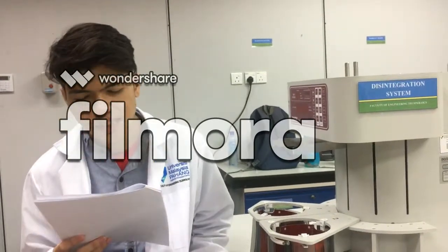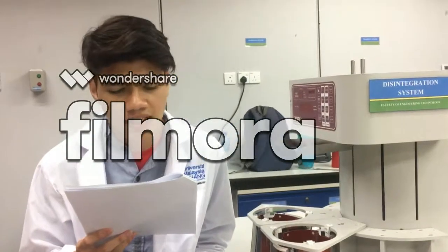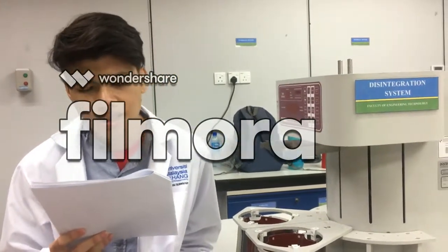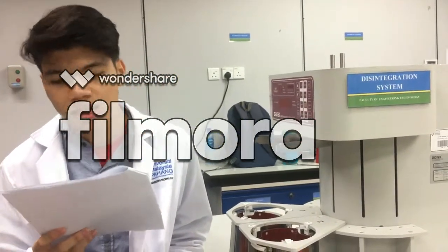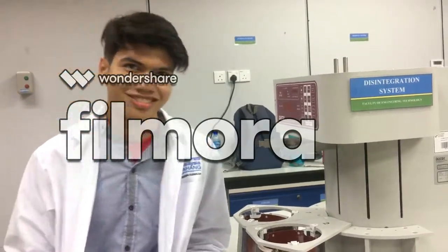So the disintegration is acceptable when there is no palpable core at the end of the cycle, and if the mass doesn't stick to the immersion disk. So let us proceed to the experiment.